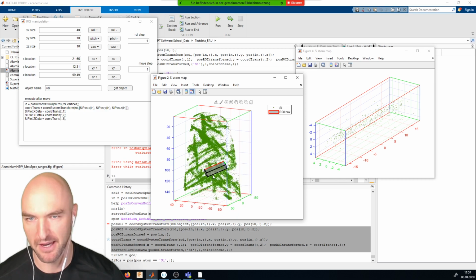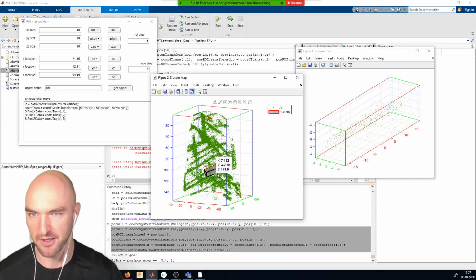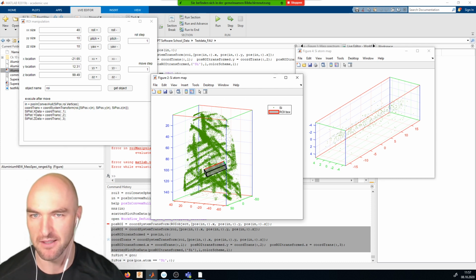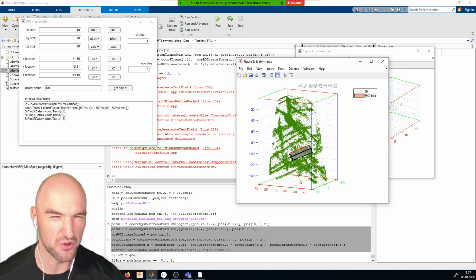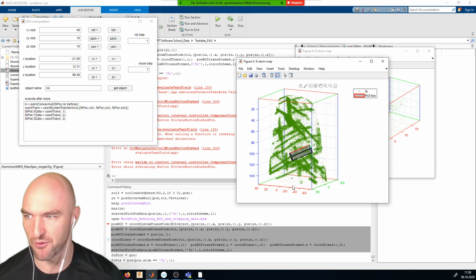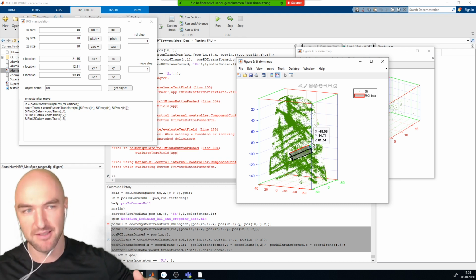If you have a very big data set and you still want to use the entire data set and keep things snappy, one very simple way is to do some pre-cropping where you just crop by the x, y, and z coordinates, and then do the convex hull test on everything still contained in those x, y, z limits. I'm not sure if I should show that to you now because that's a little bit of coding, but essentially it's a couple of lines saying just throw out everything that is below the lowest point of the ROI or above the highest point of the ROI, and below the x most and x least point, and so on and so forth.